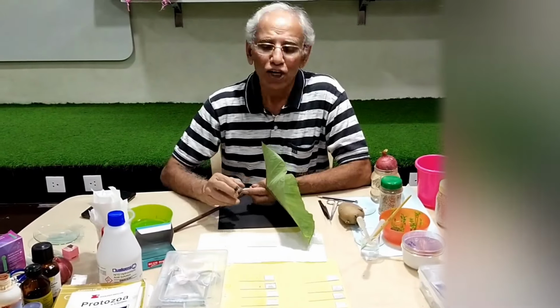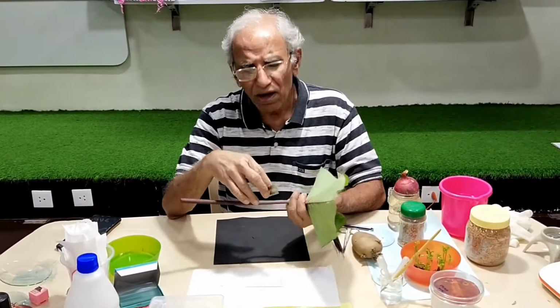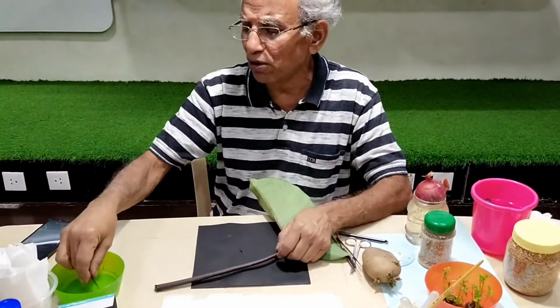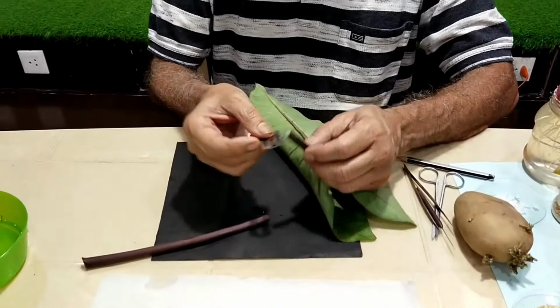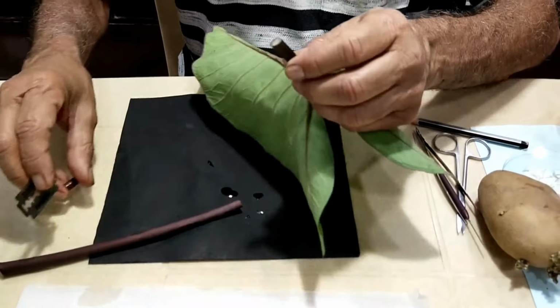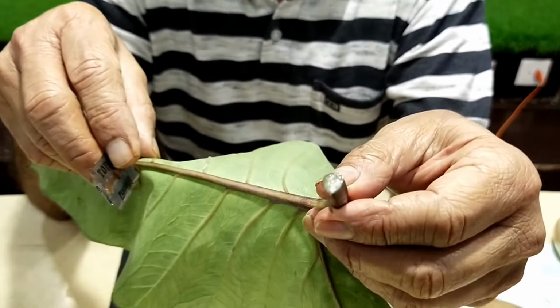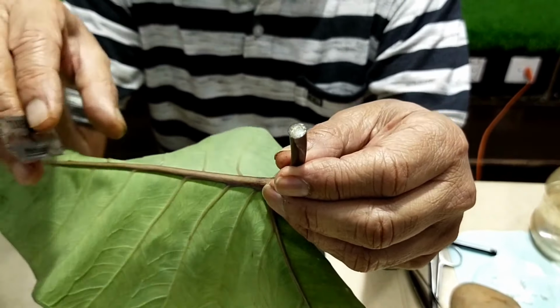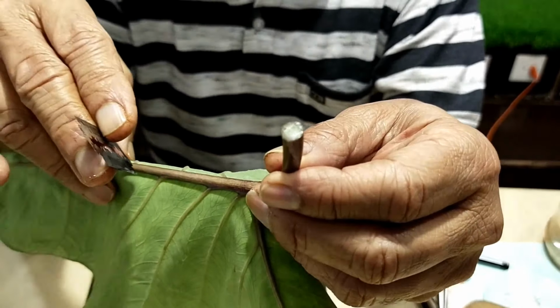Raphides. We can obtain raphides from many parts of the leaf or from the petiole. I would prefer to do it from the petiole. A very simple thing I'll do. I'll just take a piece of the petiole. It's very interesting. There is a lot of parenchyma. Here there is a lot of soft tissue. So air-filled parenchyma. I mean, the surrounding of the parenchyma has a lot of air cavities.